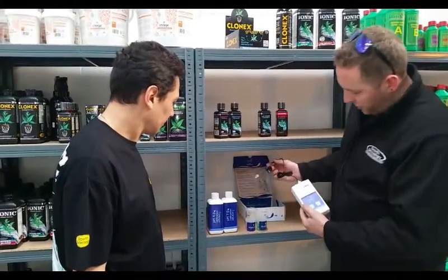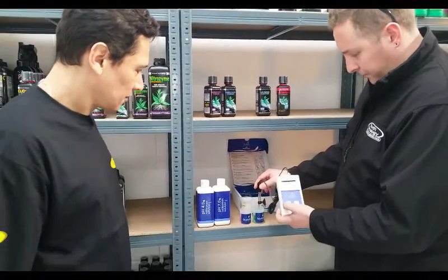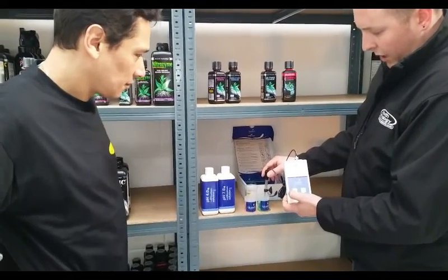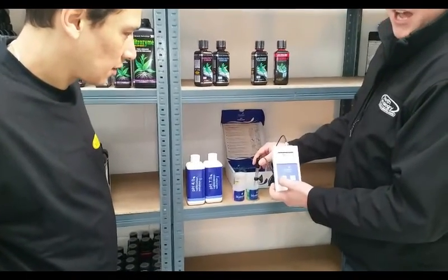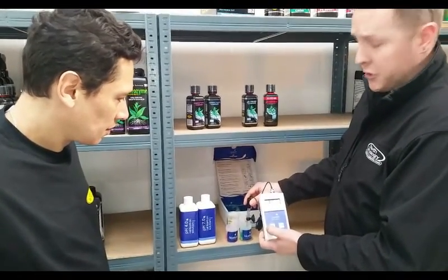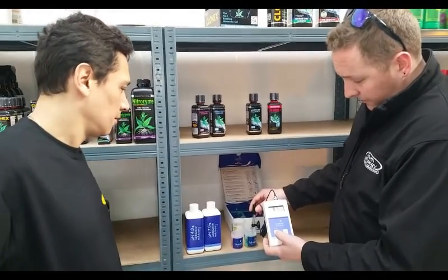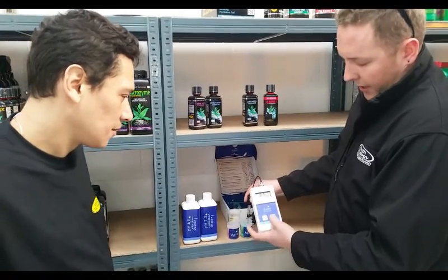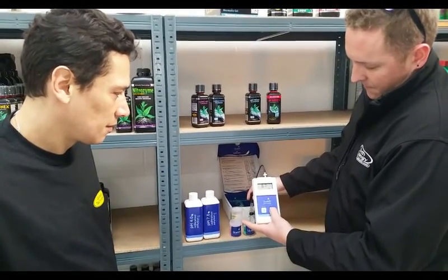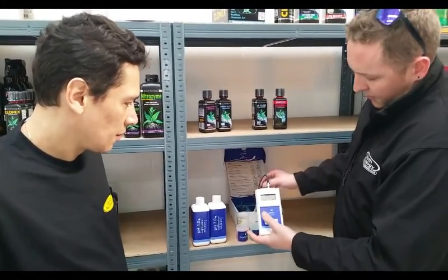First of all, we put it in the green solution. Green is always seven. We just wait for the reading to go up to somewhere near seven — it doesn't have to be bang on seven, because you're telling it where seven is on the scale. It's at 6.7, and I'm happy with that. So we just hold down and calibrate, and it will show Cal pH 7.